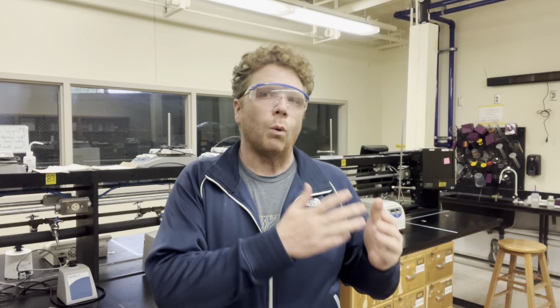So if you have 50 microliters of that enzyme, and for a specific experiment, you can get away with only using 5 microliters, you want to use 5. You want to use as little as possible so that you don't have to try to purify it again. So this first table is what we're going to be filling out with this data that we're collecting.